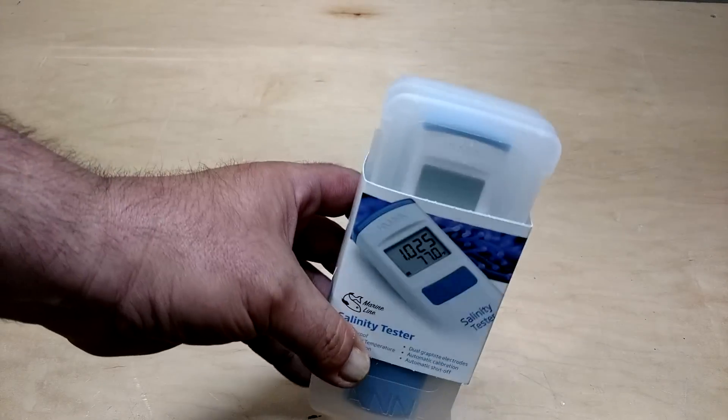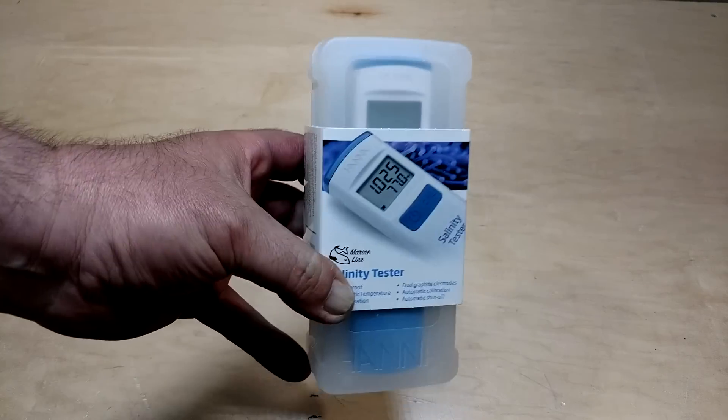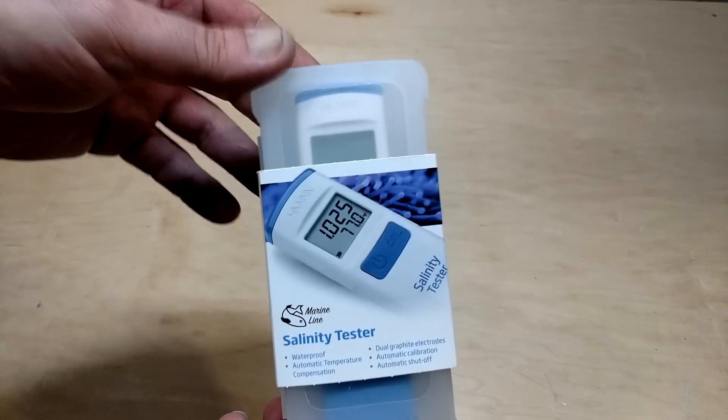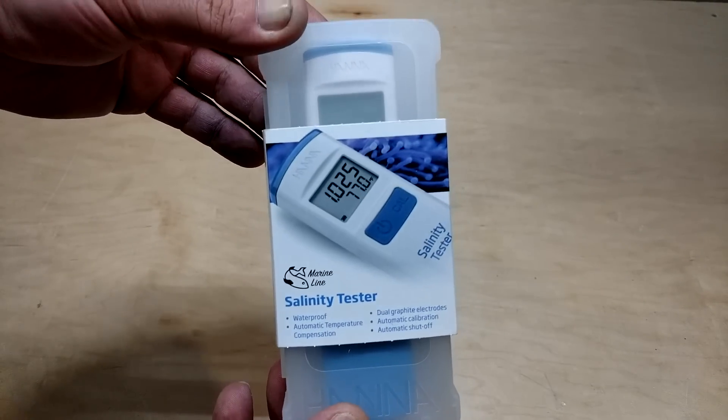What's going on everybody? Welcome back. So today we are going to be taking a very quick look at the Hanna Salinity Tester.